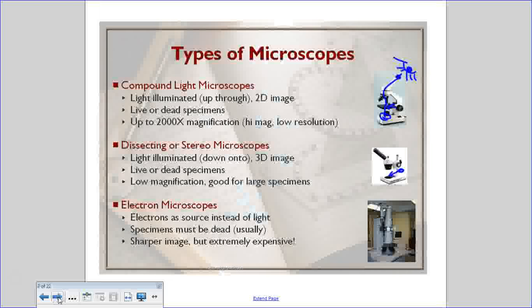Now, the last day that you were actually in class, you had a substitute, and she gave you a handout to work through, looking at the information about the types of microscopes and summarizing them. So I'm going to talk to those features, and then we'll go over that sheet together. And then I'll do another little video lesson on using the microscope.